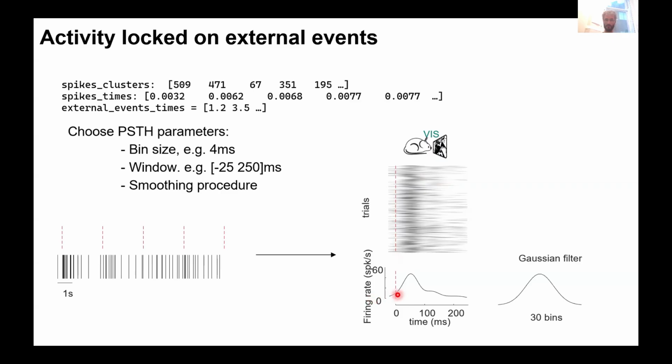But also, you're going to get some temporal absurdity, let's say. For example, here it starts to respond before the stimulus, but that's just because of the smoothing. Another thing that people do, that I've heard, is use some causal filter to avoid that. So you remove the first part of the filter that's creating this kind of increased activity before it actually starts. And you don't get that anymore, but then it shifts activity a bit. Okay, so I wouldn't use that, but I'm just mentioning it because I've heard some people use it. So you can play with this smoothing parameter.